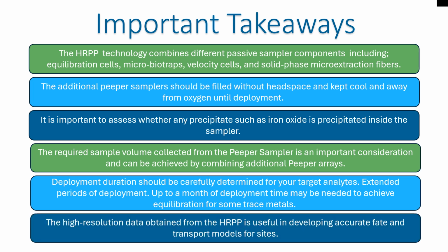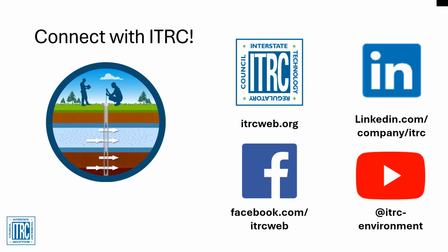The data collected from the HRPP is useful in developing fate and transport models for your site. Remember, you can learn more about the HRPP technology and others in the ITRC Passive Sampling Update online guidance document.